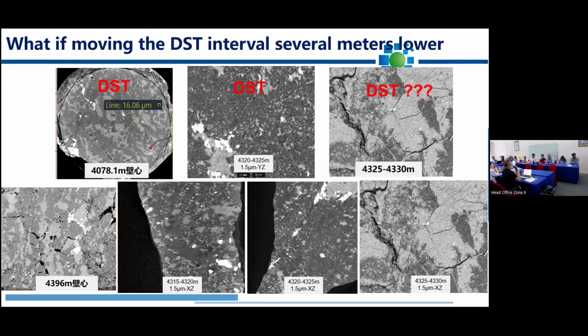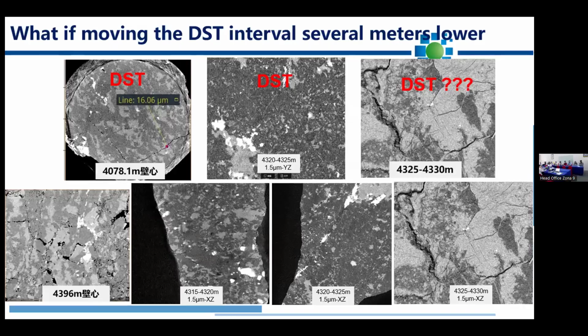Go back to your presentation. I will show you the data. Before we go, let me just use this example to answer your question. This is not the best example, but it can answer that question pretty much. These are cuttings. You look at the size, 1.5 micrometer. The whole image is about 1 to 2 millimeters.